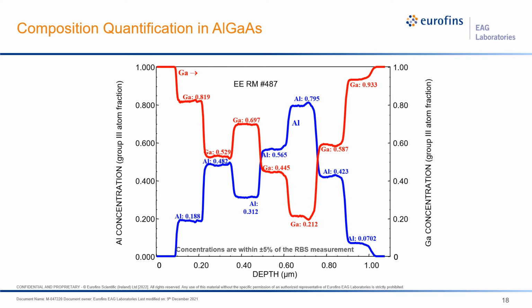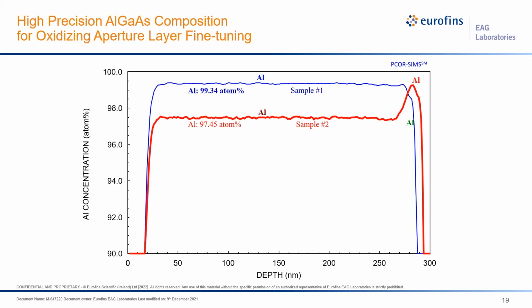So you need to convince yourselves that the SIMS intensities or calibration is consistent from one measurement to the other measurement. In SIMS, what we do is make the measurement twice or 3 times or 4 times to get a statistical deviation.